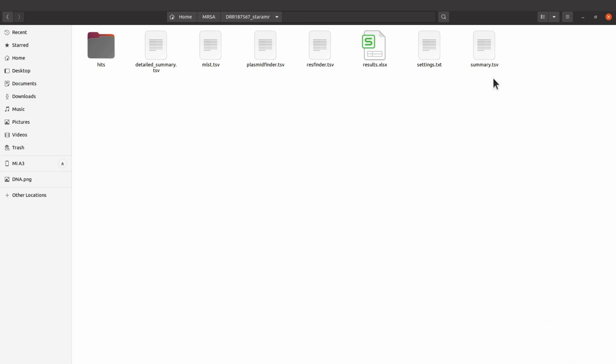All right, so these are the output files. For this tutorial, I'll focus on just this one and this one and this and this. You can open any of them with a spreadsheet software.